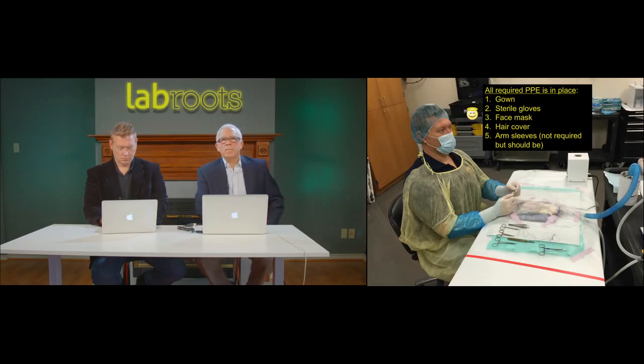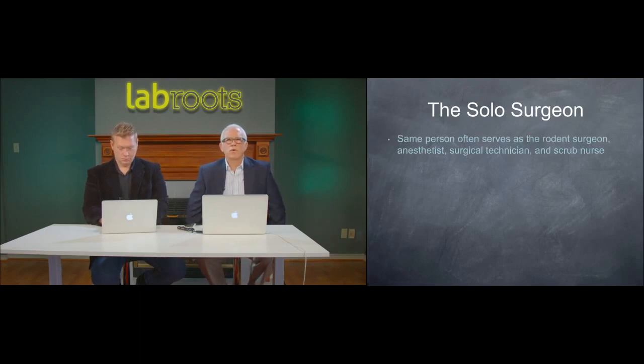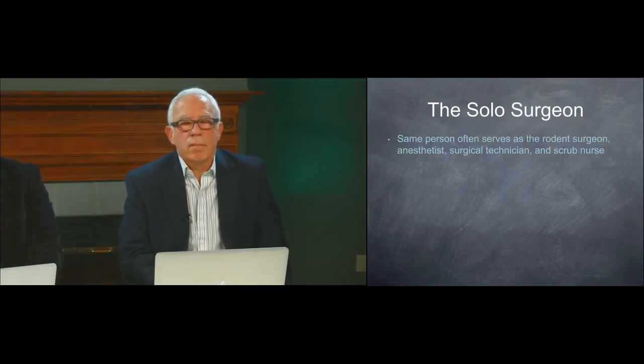So again, the solo surgeon. Once again, the same person, in particular when it comes to rodent surgery, serves as the rodent surgeon, the anesthetist, surgical technician, scrub nurse, and the gopher. This is a problem because cross-contamination is rampant in these scenarios.